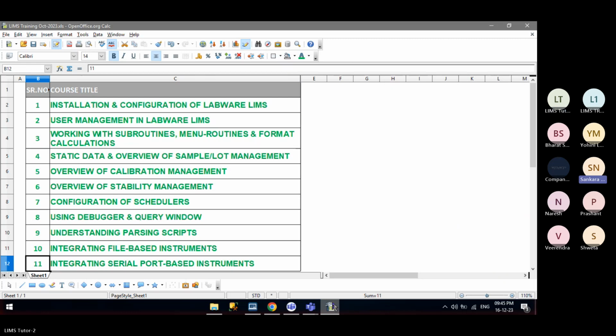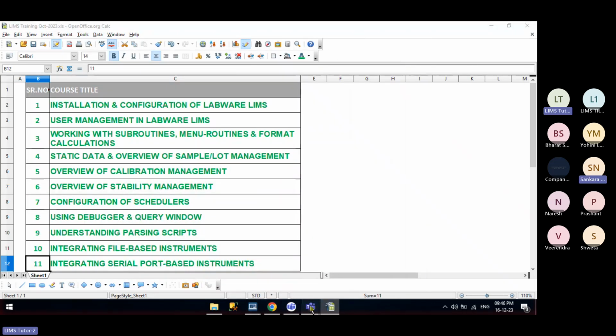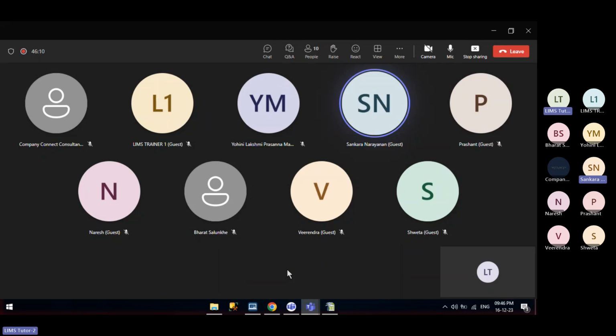If you allow me, I would like to share my experience. Previously, I worked in one company, Apotex. There, we usually connect with Empower through LIMS ID and test ID. The LIMS ID and test ID will be converted into Excel sheet format. From the Excel sheet, we will copy and paste the LIMS ID and test ID into the Empower table. Then, once again, after completion of the run, it will be passed to the LIMS through PDF.